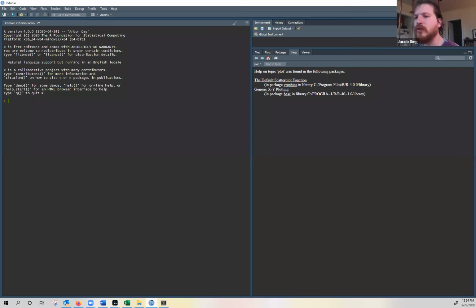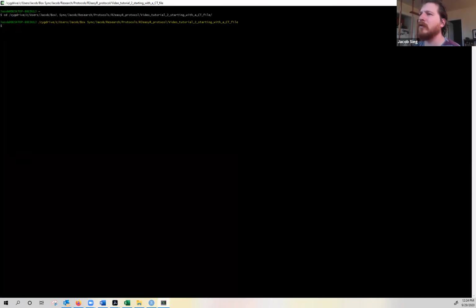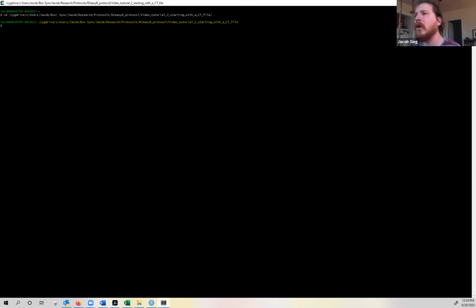So you're going to want to have two windows open to make this structure. The first is R. I'm going to use RStudio because I like it. And this is how we're going to generate structure drawing inputs for R2R without manually editing a lot of text files. And then you also want to have a bash terminal open.